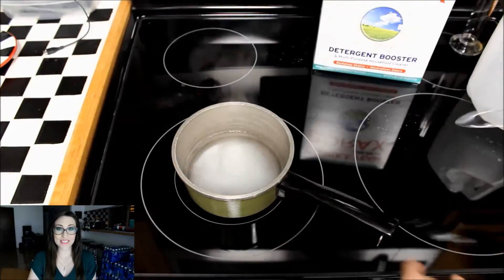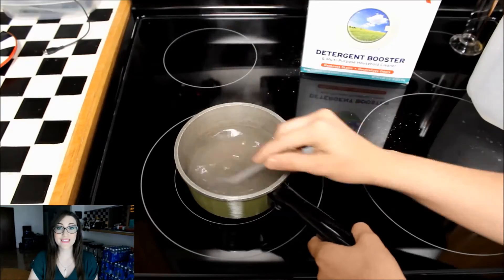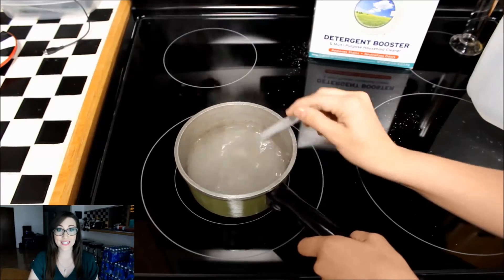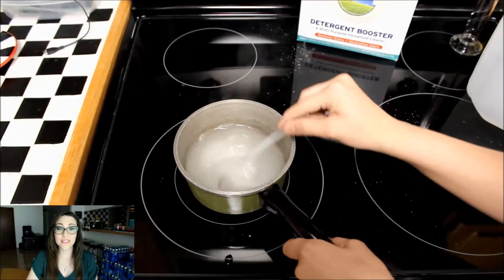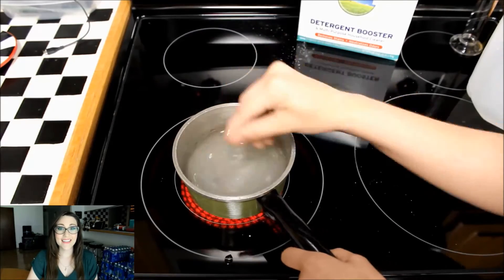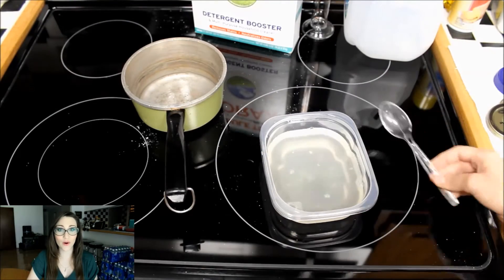Next, add in some sodium borate and stir it to dissolve it into the water. You may need to add more sodium borate to ensure you're making a fully saturated solution — you're looking for particles starting to sit at the bottom as you stir. Once you've mixed in as much sodium borate as you can and you see particles sitting at the bottom undissolved, turn off the heat and let your solution cool to room temperature. Transfer the solution into a different container so the crystals do not form in the pan.